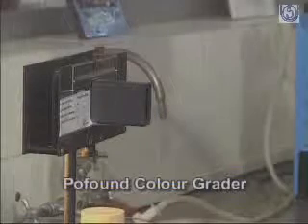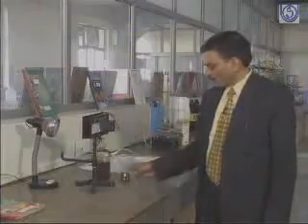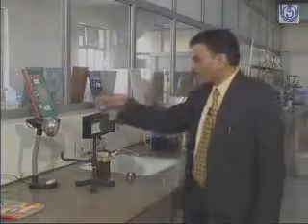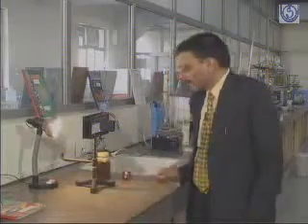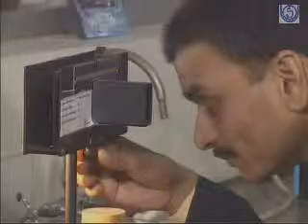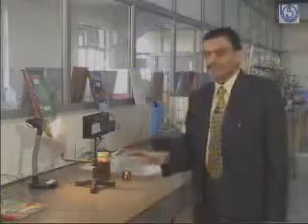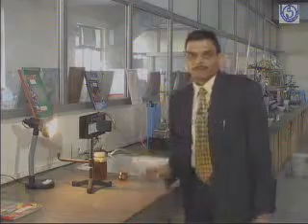This is the equipment known as Pfund color grader. By this equipment, we can know the color of the honey, and this is the international standard requirement. What we have to do, there is a cuvette. We have to put the honey into the cuvette, and we have to put on the light and match the color. And after matching the color, we can note down the color of the honey, how much color is there, and it is recorded in mm.